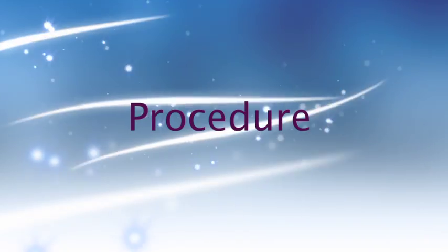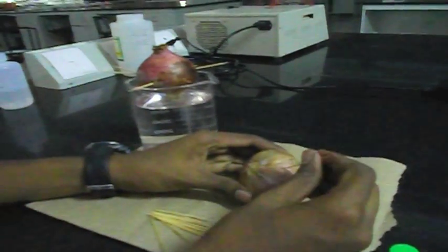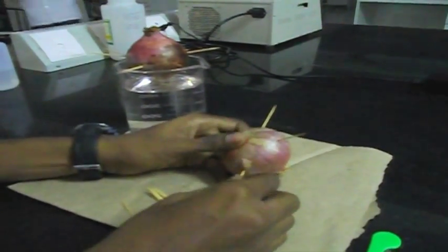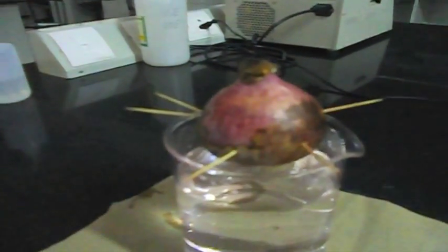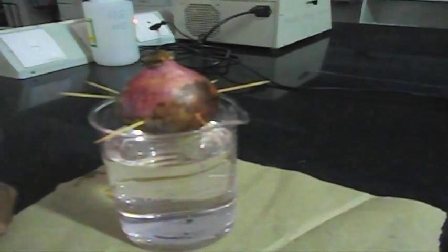Procedure. Growing the onion root. Take an onion and poke around four to five toothpicks on the side of the onion about the halfway mark. In a beaker, add water to the level where the root is submerged, preventing overfilling and spilling.